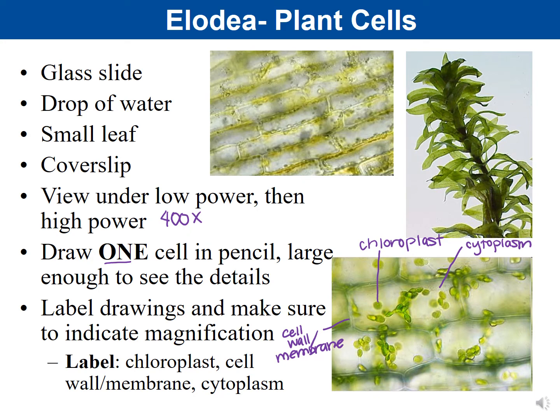And so when you do this, though, don't draw all these cells. Draw just one cell, label the parts. So just like I've done here, but draw one of those cells only.